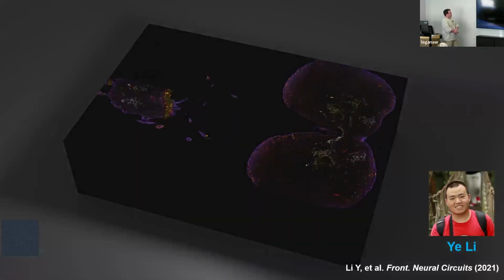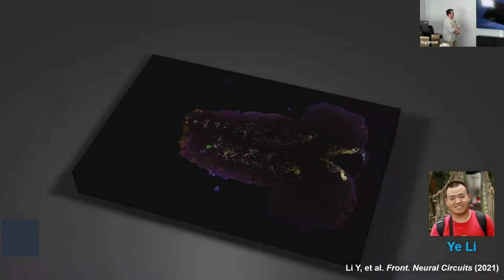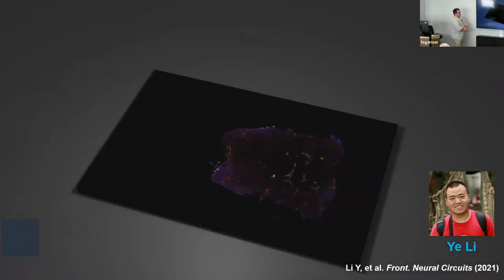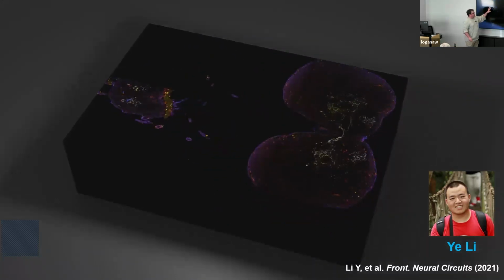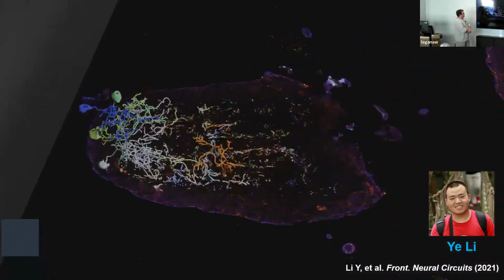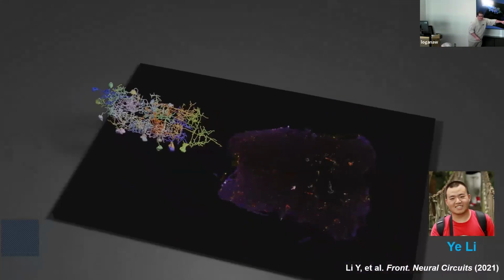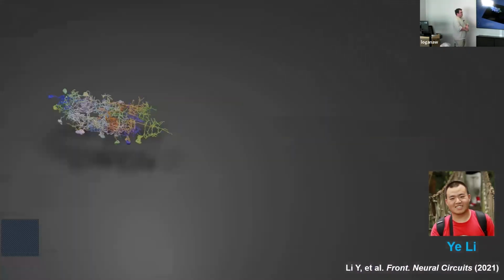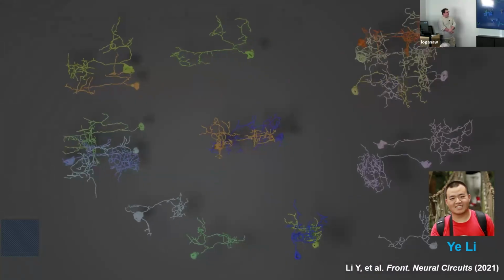So in Dahlon's lab, we focus on doing this using light microscopy-based approaches. Primarily, and I won't be talking about the technique as much today, we use a technique that we call Brainbow or Bitbow. The idea is that in the little animation you're seeing here, all of these little colored lines, and a lot of them on the projector look a little bit pale, but they all are different colors, if you trust me there.